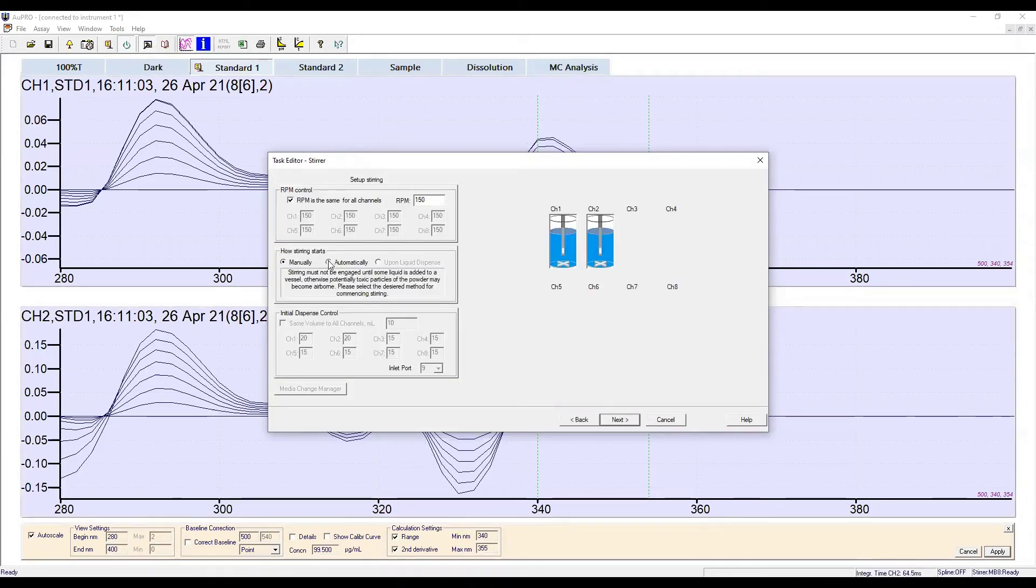The next screen allows the analyst to set up the stirring parameters for the assay. The stirring speed is input, along with the countdown delay, allowing the analyst time to add sample to each channel in turn before stirring and data collection is commenced.